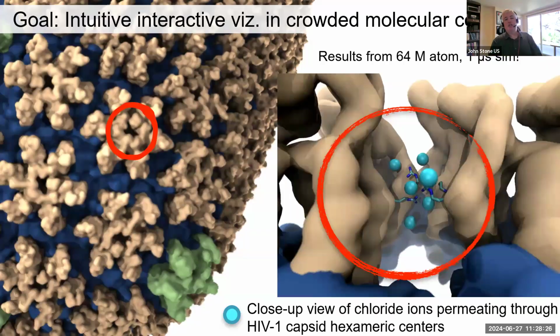Another thing that's interesting is, as I pointed out before, the ambient occlusion lighting makes it easy to identify things like the pockets, pores, and cavities. In this HIV capsid, you can see it's composed of a large number of hexamers. Every one of those hexamers has a little pore in the center. If you had to adjust the position of a light manually to see that shadow, you'd have to have it in just the right place.